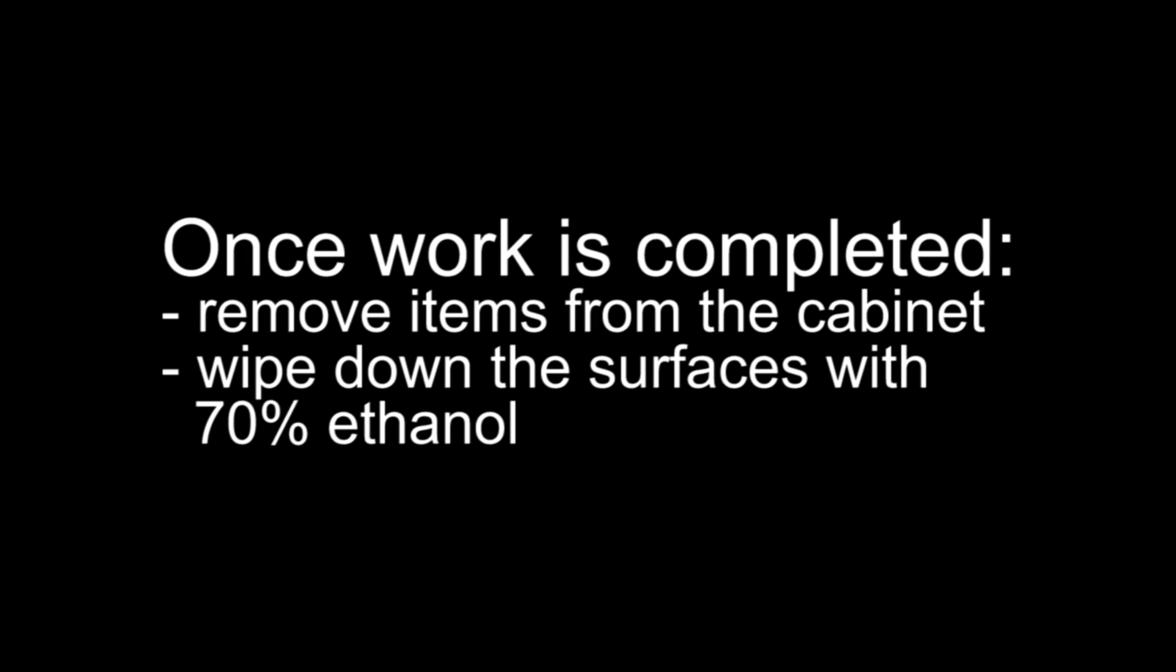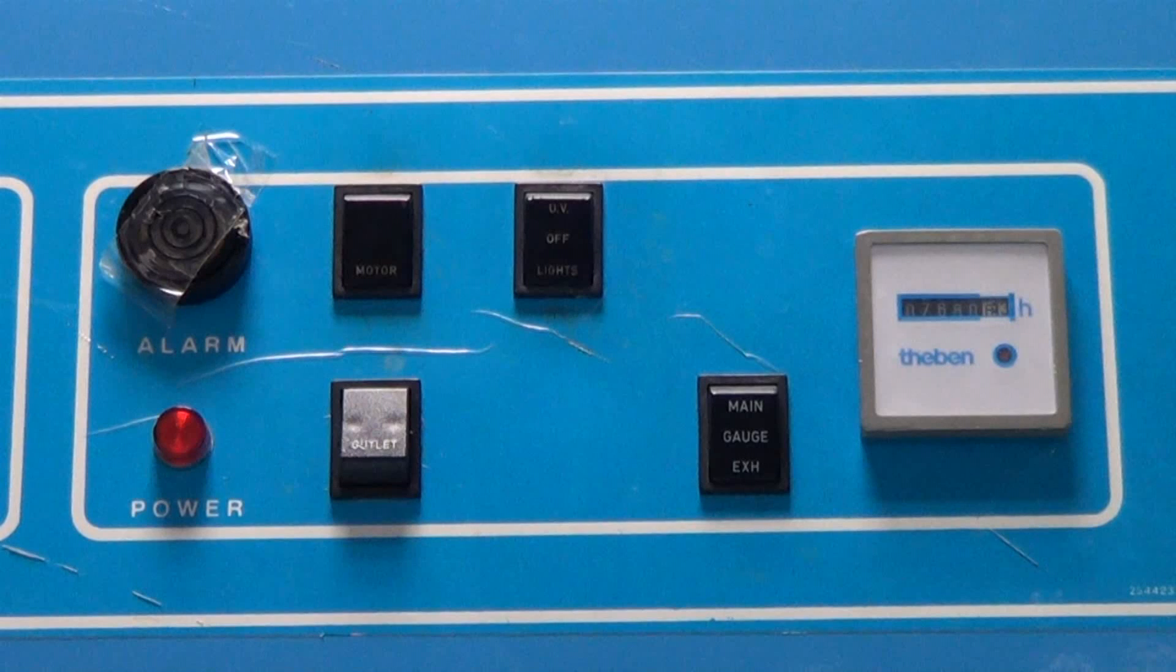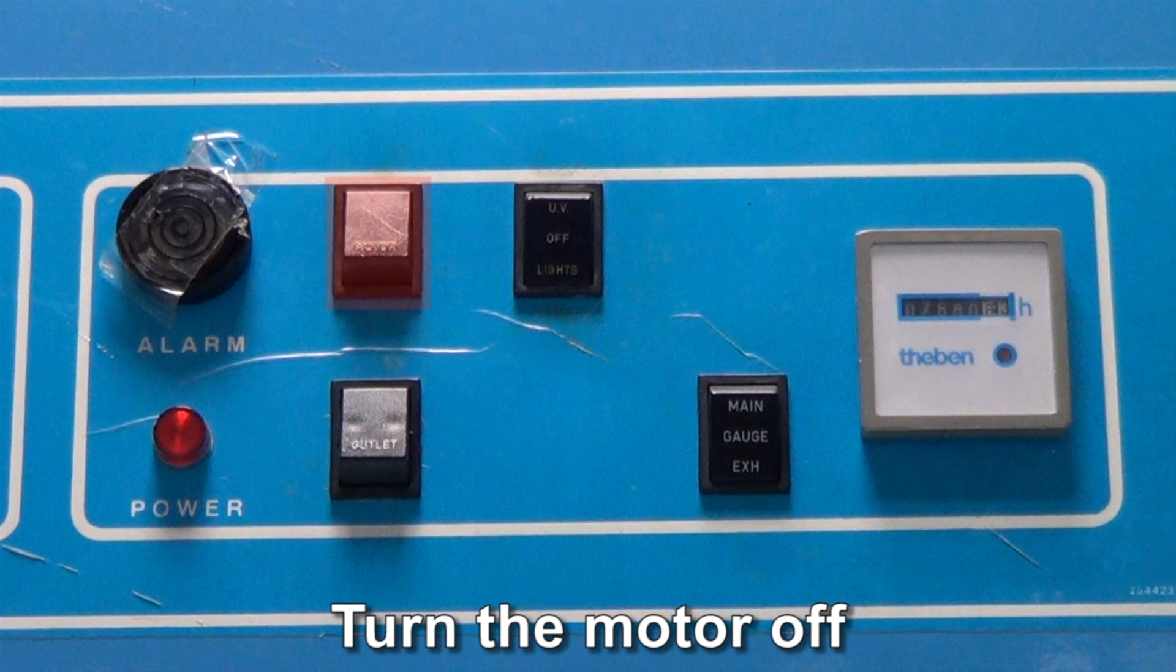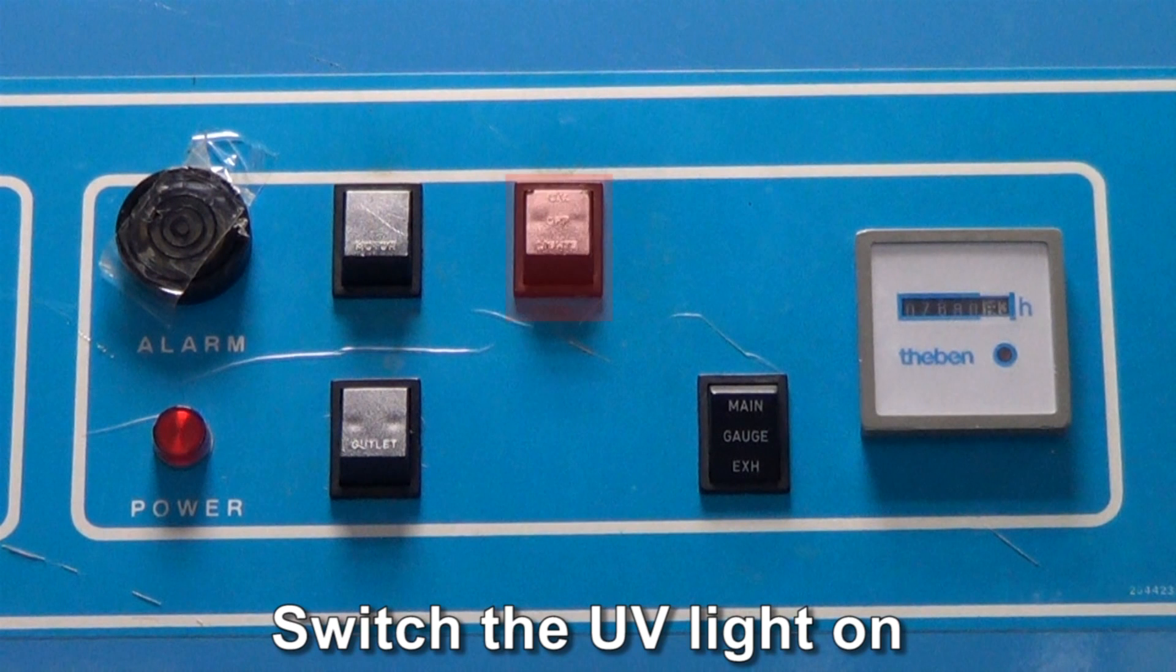Once your work is completed, remove your equipment and wipe down the surfaces of the cabinet using 70% ethanol. Turn the motor off and turn on the UV light.